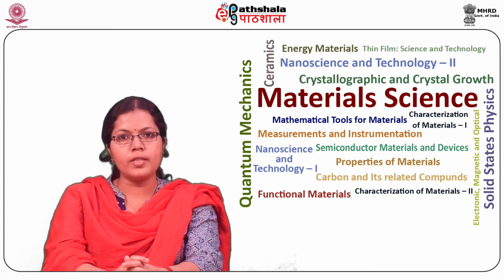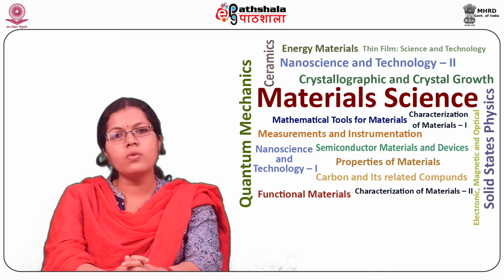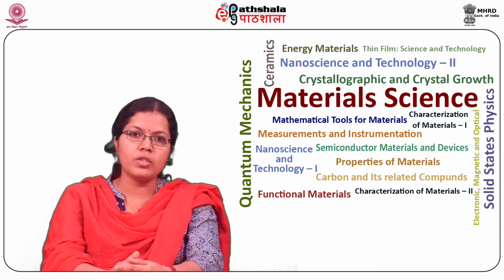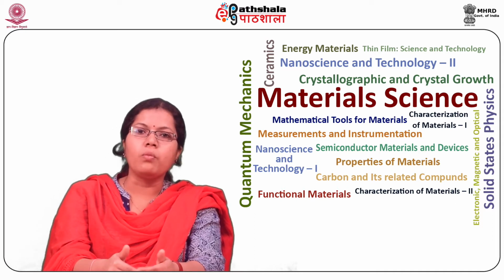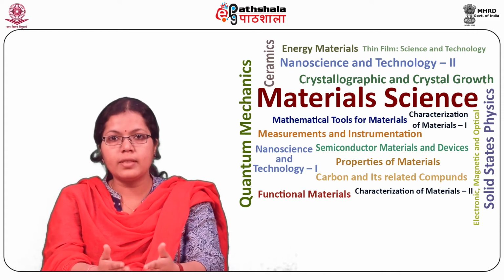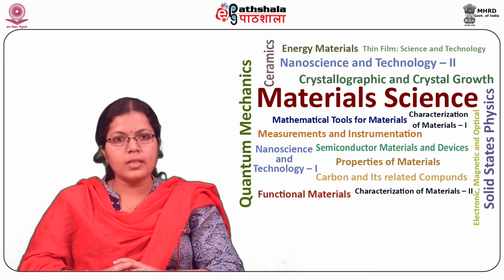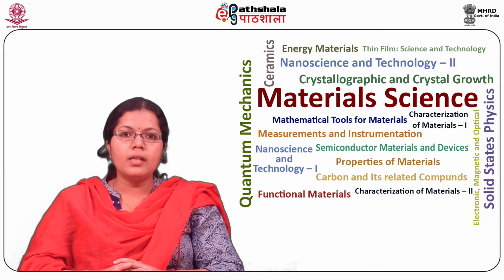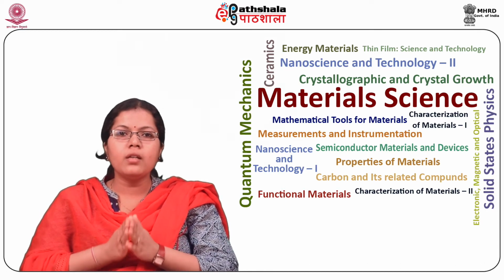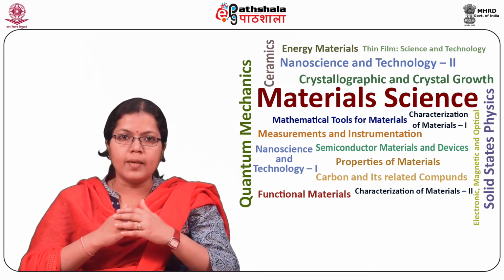In electron microscopy, electrons emitted from a source are accelerated by an applied voltage, which can vary from a few kilovolts for SEM to a few hundred or even thousand kilovolts for TEM. The high energy electrons are focused to a fine probe on the sample or the bulk or specially prepared thin samples. The interaction between high energy electrons and the atoms of the sample gives rise to a variety of signals. The detection and quantitative characterization of the signals form the basis of SEM and TEM.